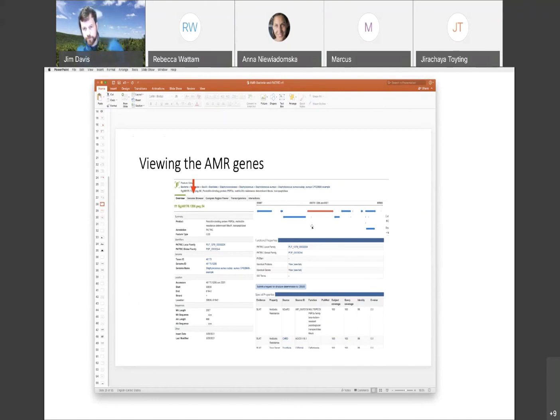But I think that's because there's a strong association with the SCCmec element and these other forms of resistance. They're really neat because they draw your attention into an area that is interesting. And it also gives you a sense, you can feel the correctness of it or not, if you're seeing them all classifying around known genes.